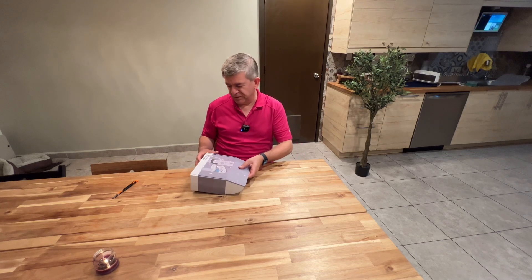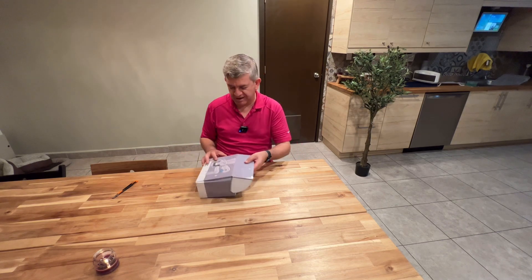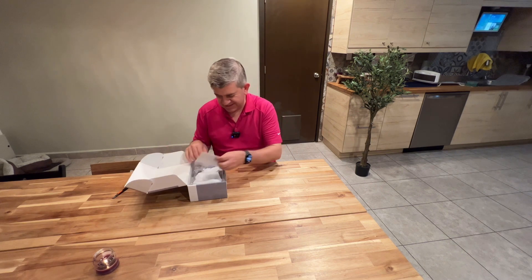Hi friends! Let me show you the new portable microscope that I got. This is really nice equipment.